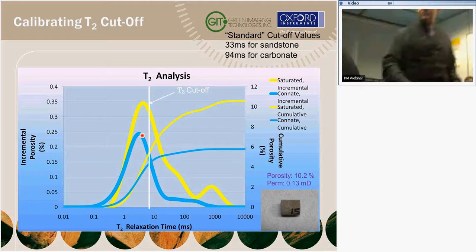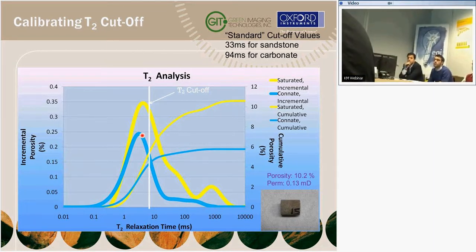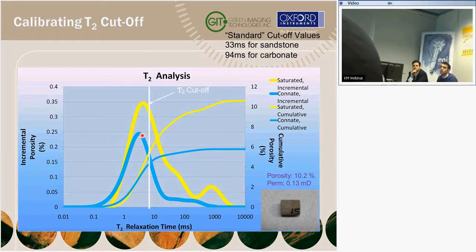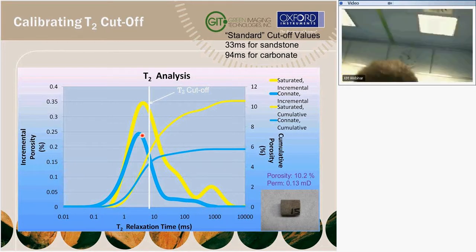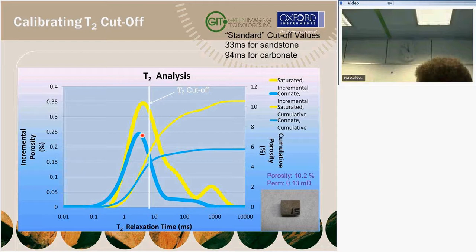You mentioned that you can separate or distinguish the oil from the water with NMR. So are you able to calculate the saturation of the fluids inside the core, at the end of a core flooding or the initial water saturation? In order to distinguish between fluids, oil and water, the oil and water need to be different from an NMR standpoint.